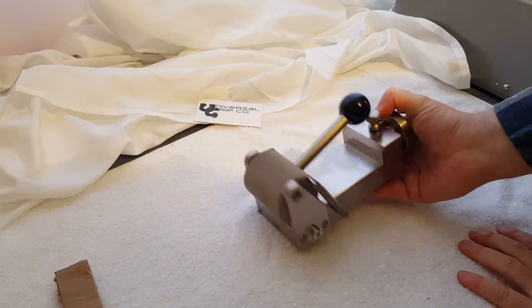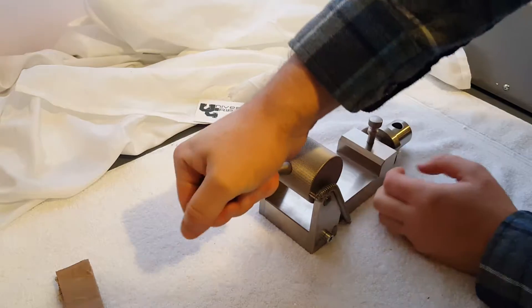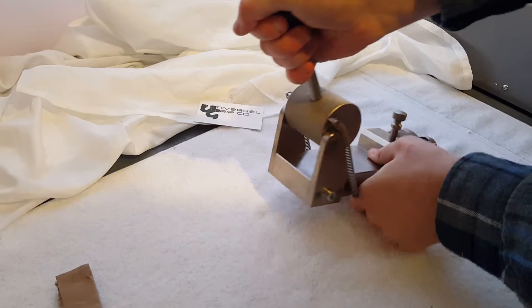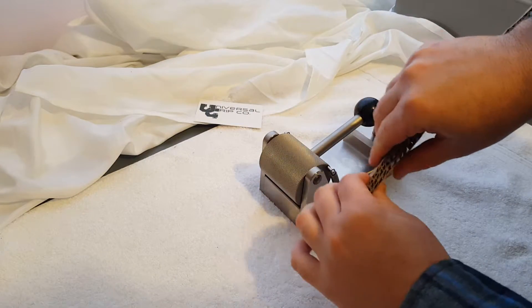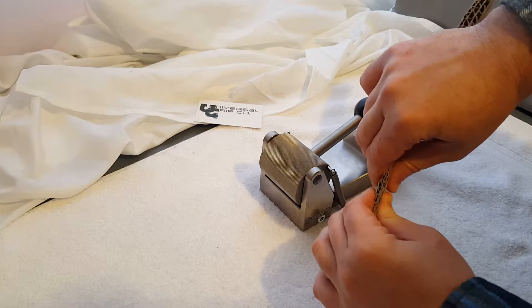This roller grip is capable of testing a sample up to 8mm thick. So it's perfect for samples that are a little bit squishy and that would be difficult to hold with other types of grips.